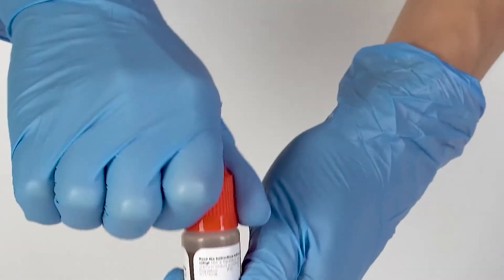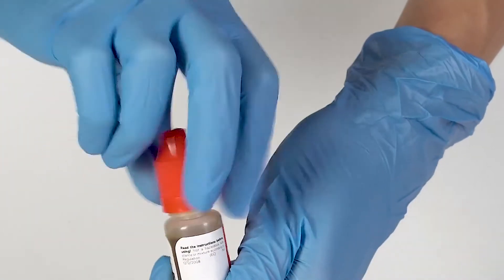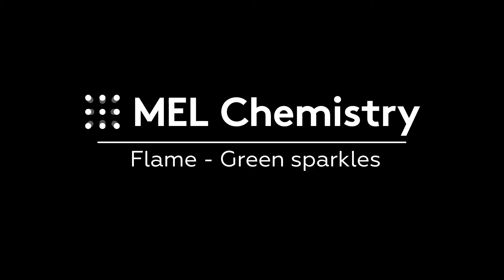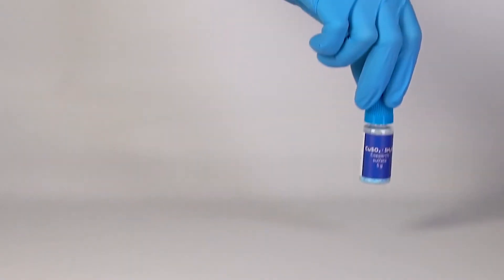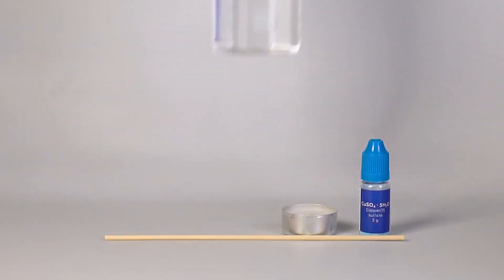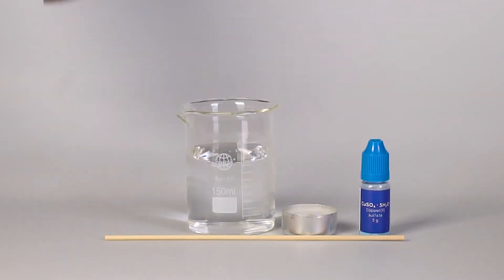To open a bottle containing a reagent, push the cap down and turn it. For the green sparkles experiment, you will need copper sulfate, a candle, a splint, some water in a beaker, and matches.